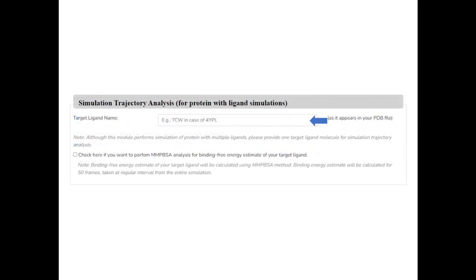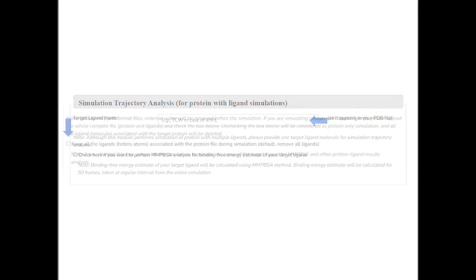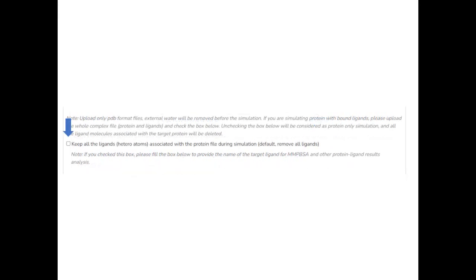Checking this box will activate the panel below for providing information on the target ligand for post-simulation processing. If you are doing only protein simulation, then leave this box unchecked.